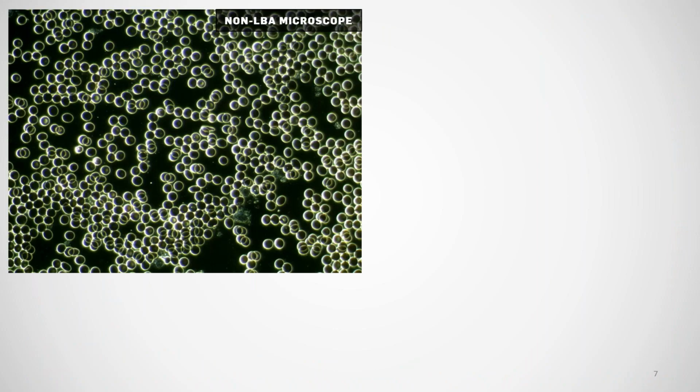All right, fantastic. So what we often see with these non-live blood analysis dark field systems is that you're really just seeing a bright field image or bright field anomalies, but in dark field. So it doesn't really allow you to see any of the actual dark field anomalies that you should be able to see. It's just purely a darker image. So we are able to see a few target cells here, but the magnification we can see is actually quite low, and the contrast is also very, very low.